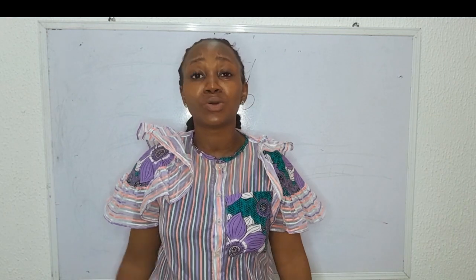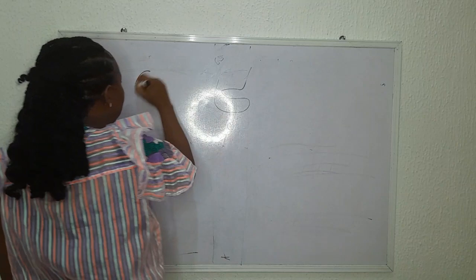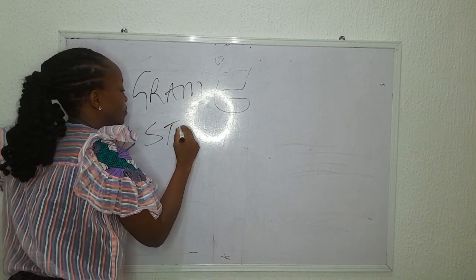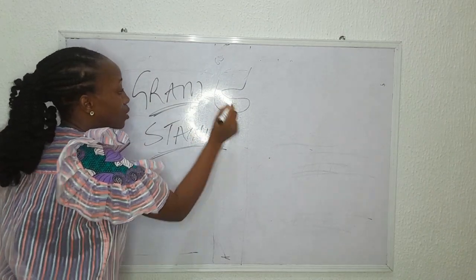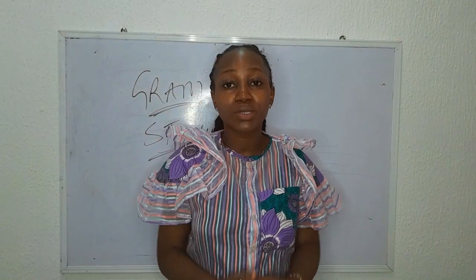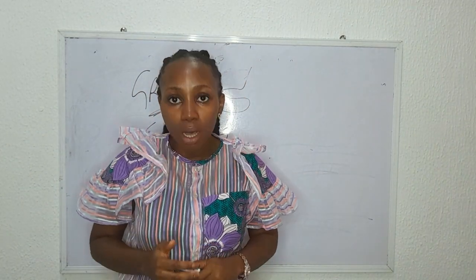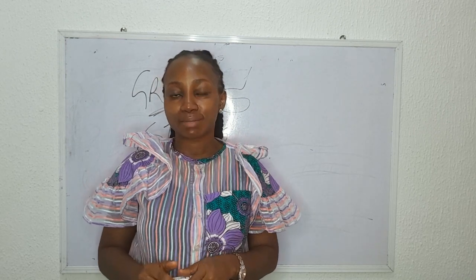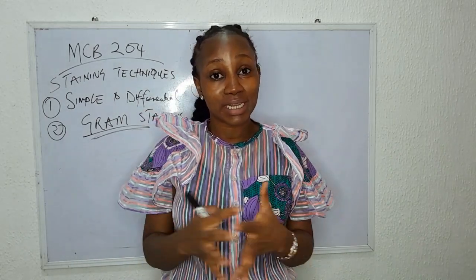Tag along, and today we'll be talking about something important. We're talking about gram staining. That's what we'll be discussing today. Come on board to my class, okay? It's going to be fun and exciting. Stay tuned. The most important part of this class we'll be talking about today is the gram staining technique.